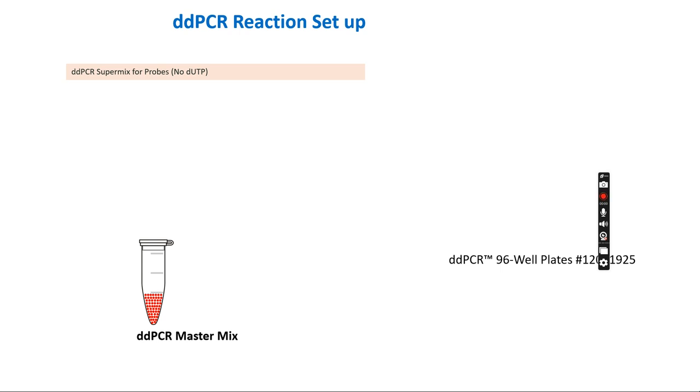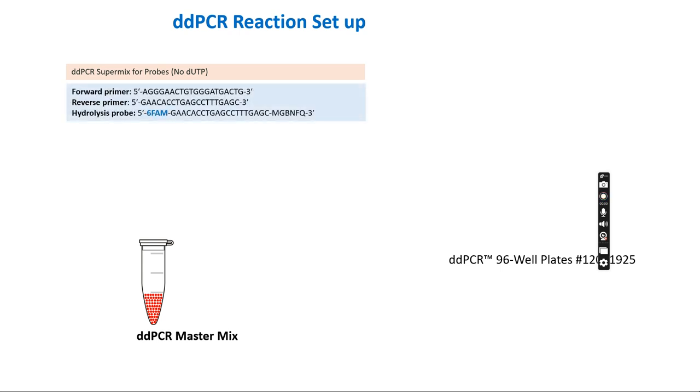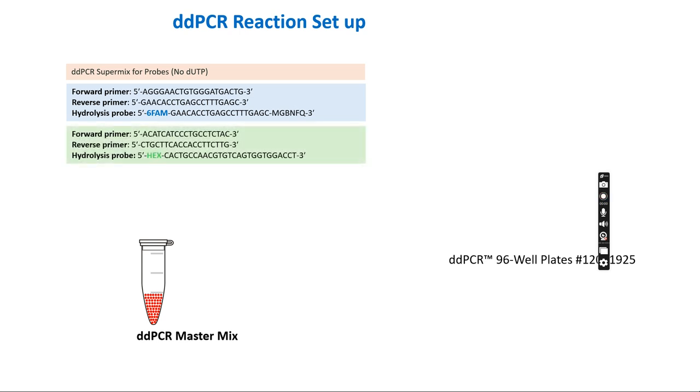But if you are a Thermo Fisher person, you can use Thermo Fisher or others as well. The second thing, you will add the primer and probe sets for VSVG and the primer and probe sets for your reference gene. And then the restriction enzyme, as I just mentioned, it is better if you use a restriction enzyme, then you will have very little or no non-specific amplification.